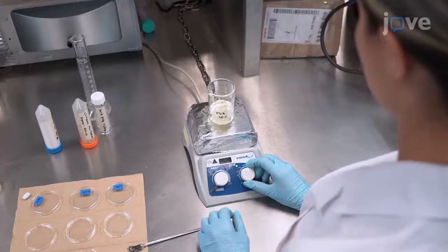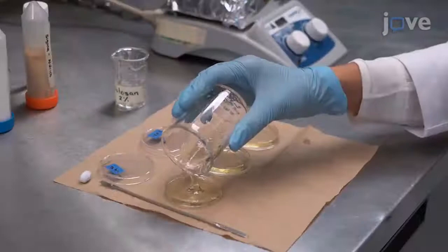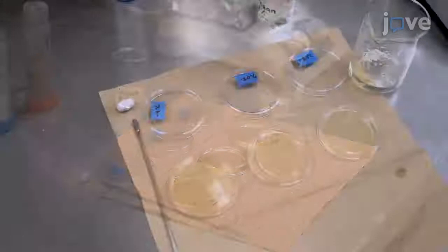Pour the mixture into petri dishes. Leave the samples at atmospheric pressure for 2 hours to degas. Then freeze the hydrogels.